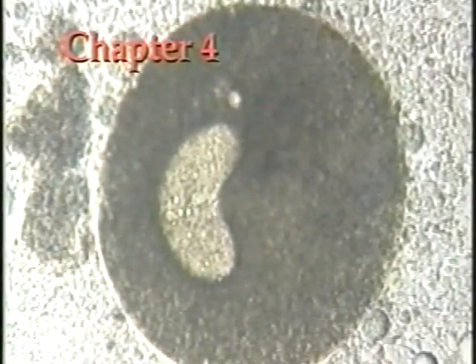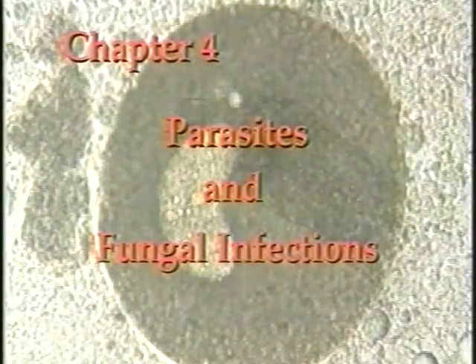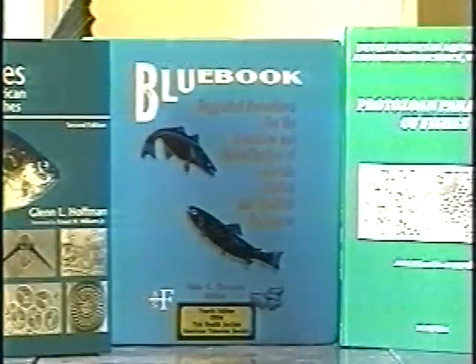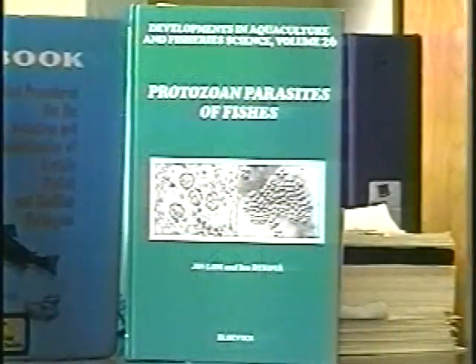This final chapter covers general procedures used for diagnosis of parasites and fungal infections. There are hundreds of protozoan and metazoan parasites identified from salmonids, and this chapter will only provide an overview. For more information, refer to the Blue Book or to references like Parasites of North American Freshwater Fishes by Hoffman and Protozoan Parasites of Fishes by Lom and Dyková.